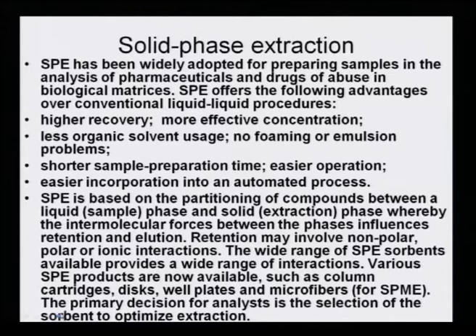The primary decision for analysts is the selection of the sorbent to optimize extraction. The bottom line still remains that the analyst has to decide what the analyte is and how to extract it, whether it is in macro quantity or micro quantity, and which of the methods that I have mentioned must be applied for an efficient extraction process.